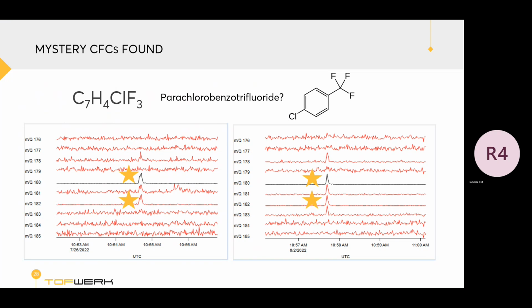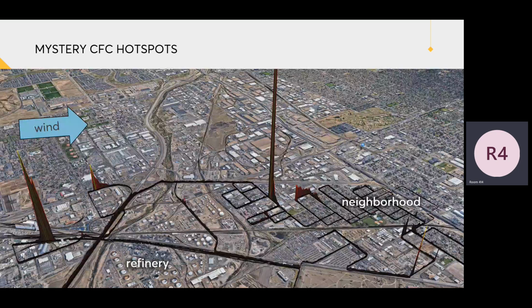On the map, we see enhancements of it, so it's all 7 drives together this time. If we want to investigate this compound further, a good tactic might be to take your sample right here, and then run it through GC offline later to get a really good idea.